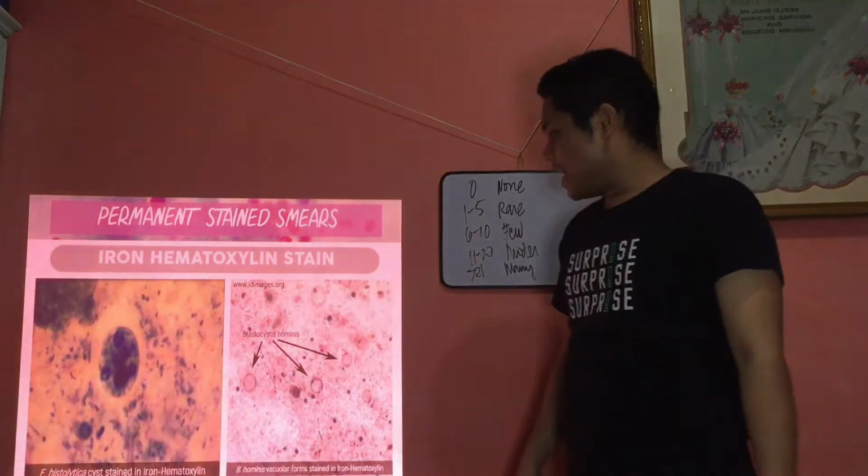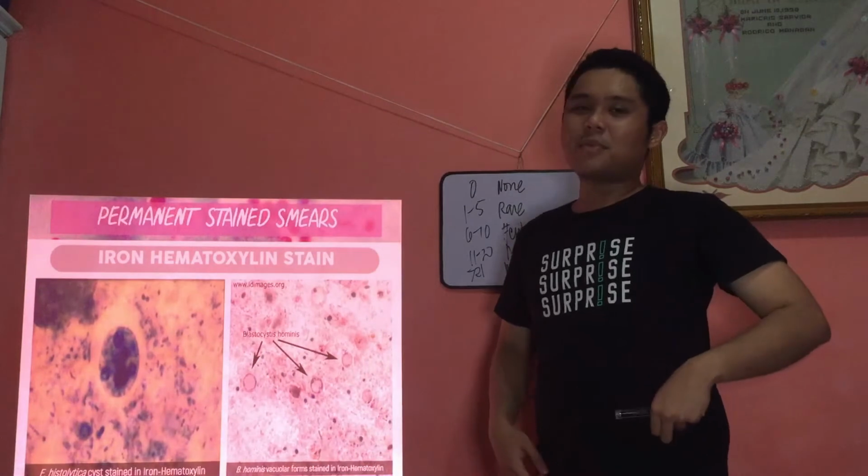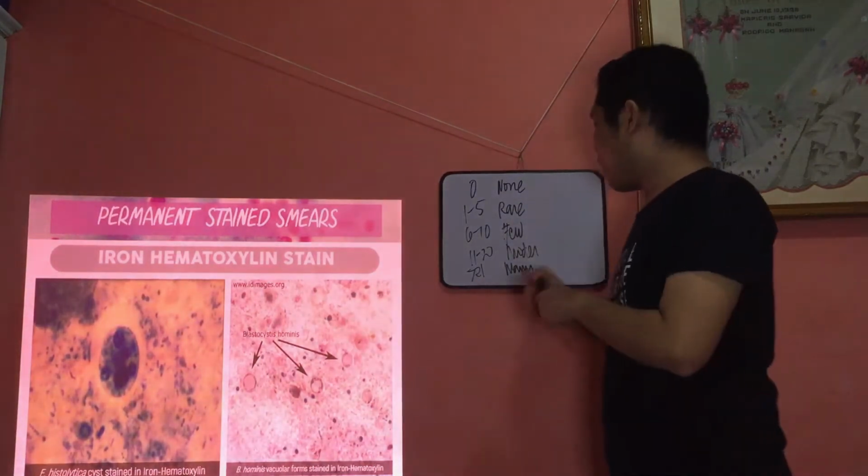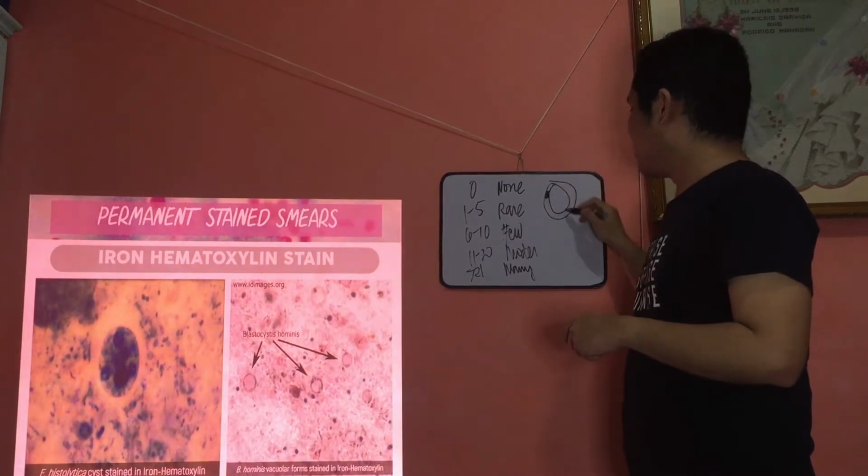Alright, okay. Ayan, so should I discuss Blastocystis? No, it's a lecture na. I think na-discuss na naman, Bernal. Okay, so this is the vacuolar form. Your Blastocystis vacuolar form, ganun siya. Tapos may mga nucleus diyan.